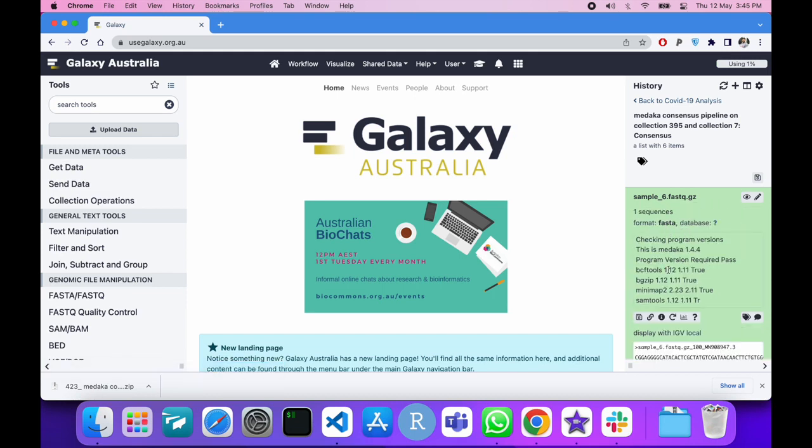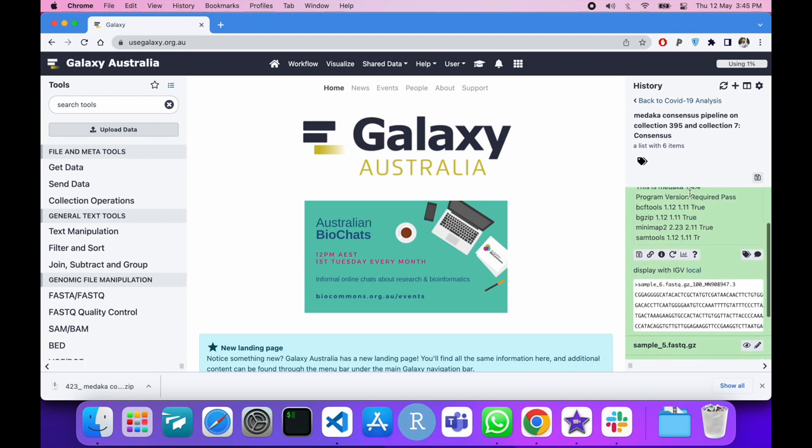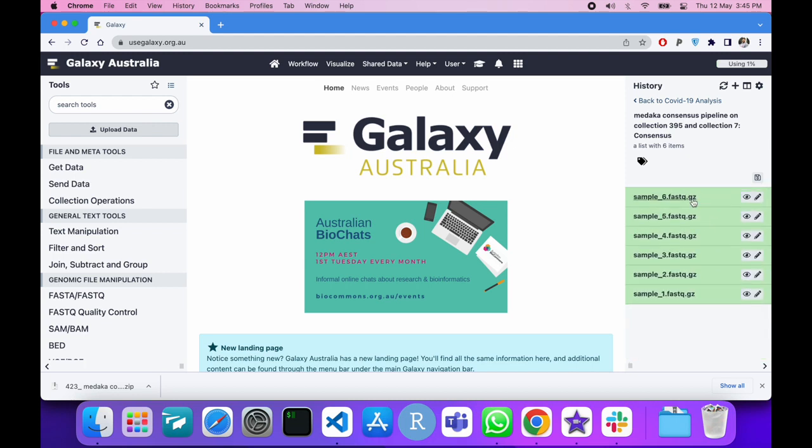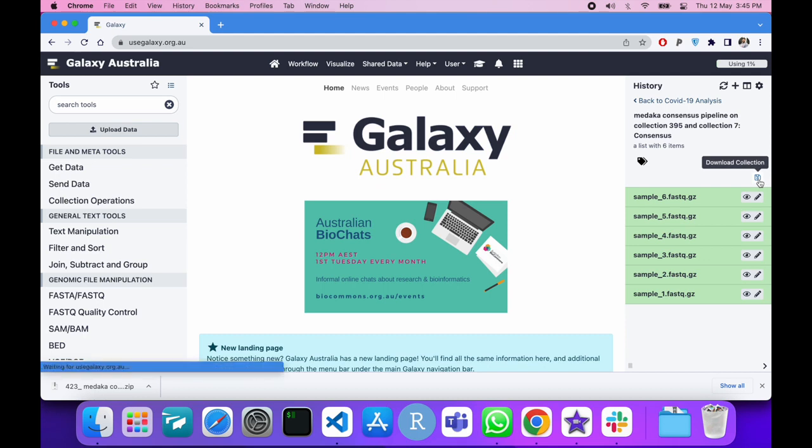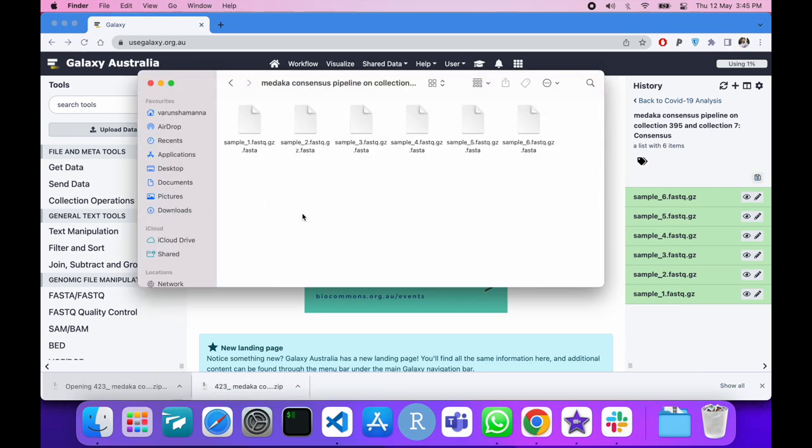Now you can view the output of all files in the FASTA format. Click on Download Collection to download all the samples. This will be a zip file with the assembled genomes. The files are named in the sample name .FASTA format.